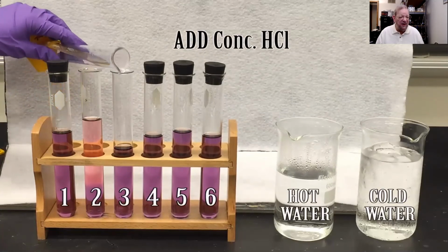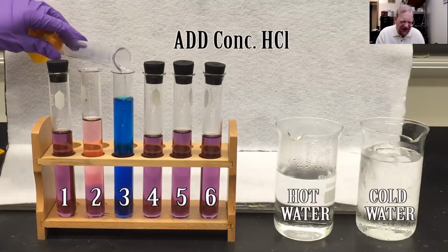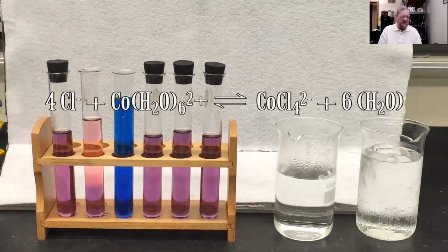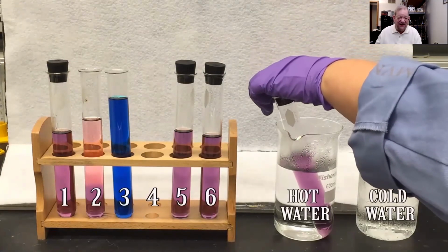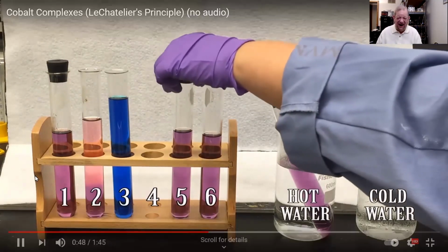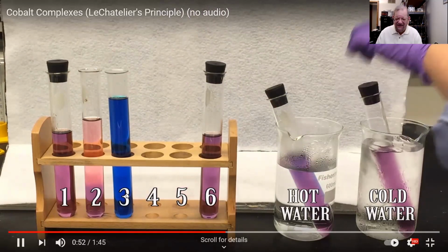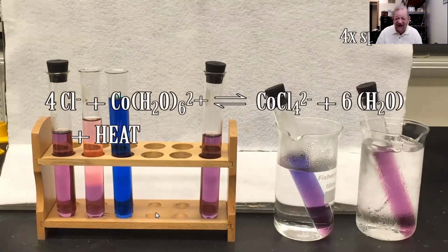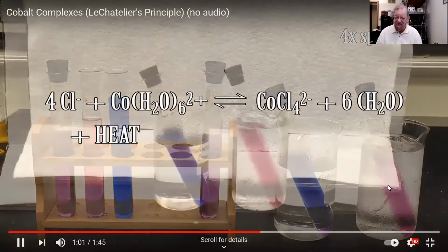Now they're adding Cl minus. Oh, look, it's going blue. Is that wicked? Isn't chemistry great? Dr. White's having a good time now. I love Le Chatelier's principle. Now look, they're putting the equilibrium in hot water and in an ice bath. And the hot water is turning blue. In the cold water, it's pink.